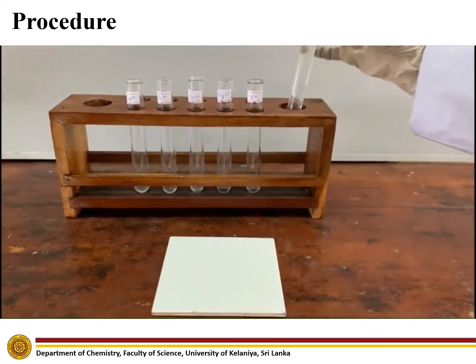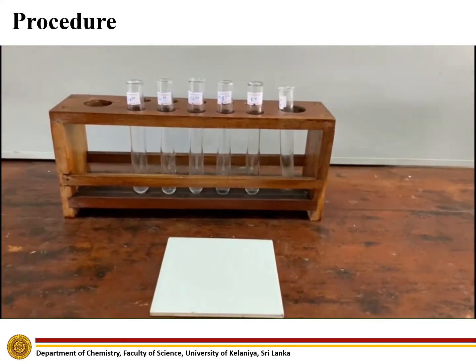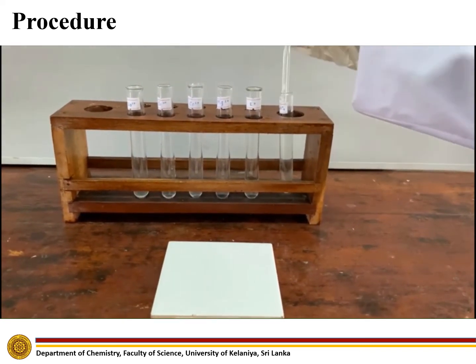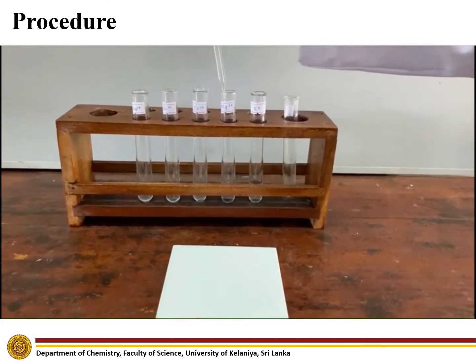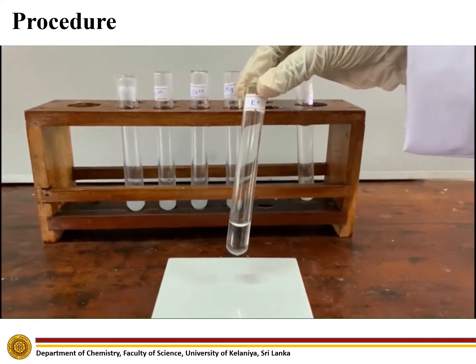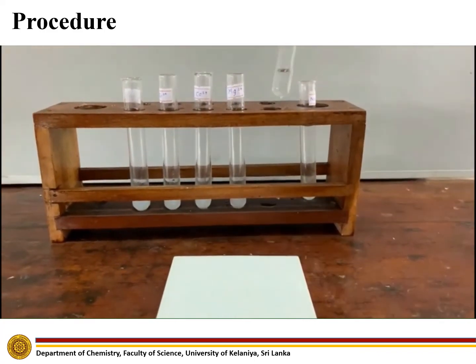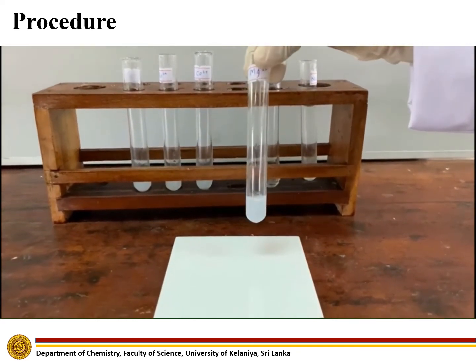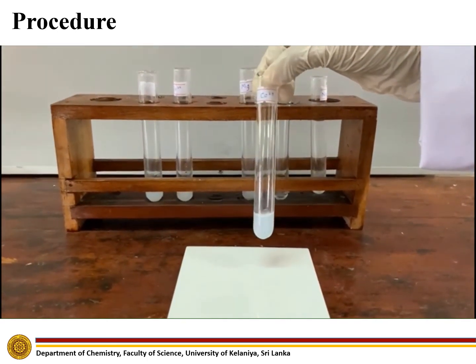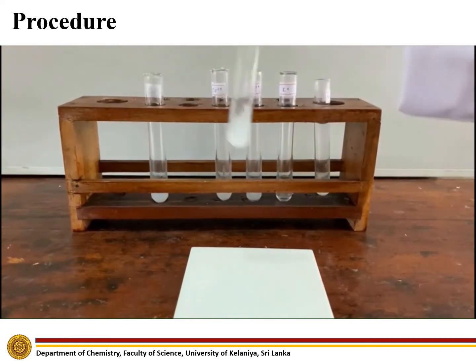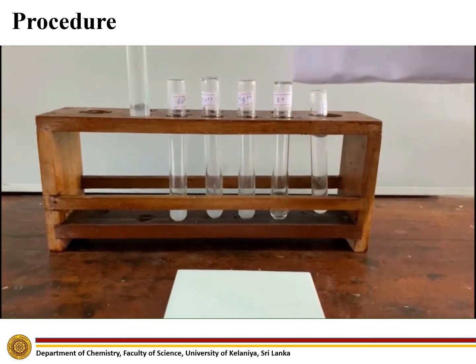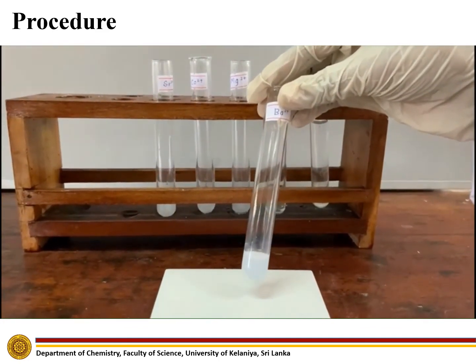Add sodium phosphate to the given cation solutions. It dissolves well in potassium ion solution. A white precipitate forms in calcium ion solution, strontium ion solution, and barium ion solution.